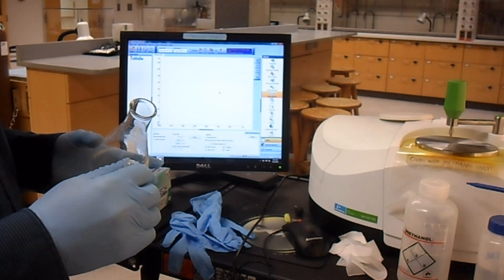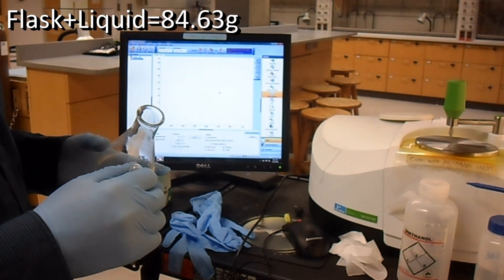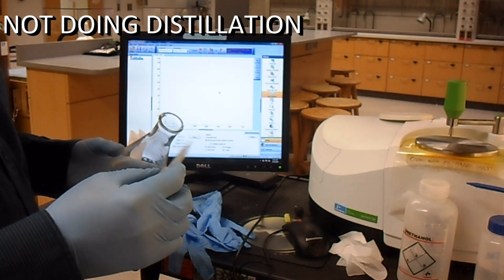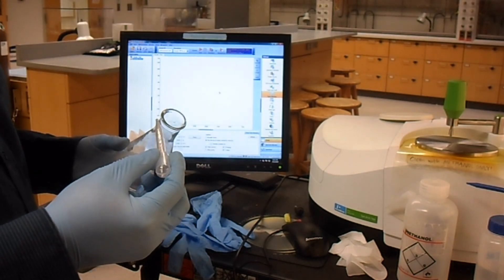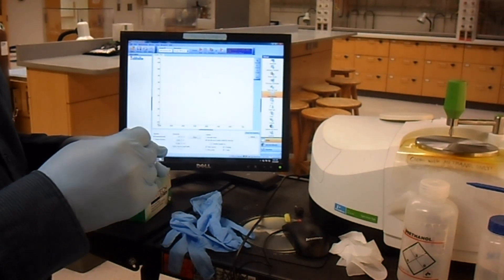So at this point, we're going to take a weight of our liquid. So we've weighed our flask. Our flask weight with the liquid in it is 84.63 grams. We are not doing the distillation. We are not doing the purification part of the procedure, but we are going to do the IR. So we're going to take an IR spectrum for you.